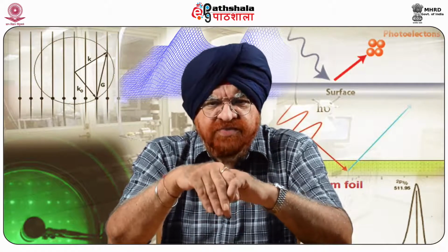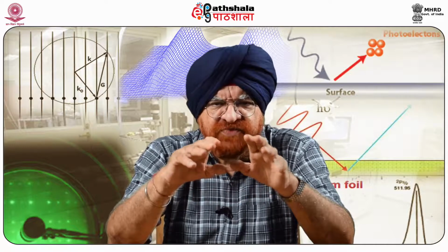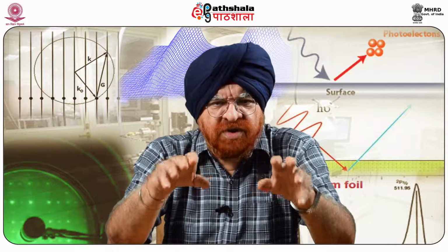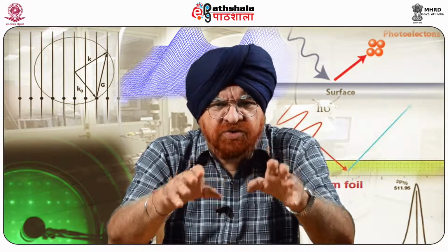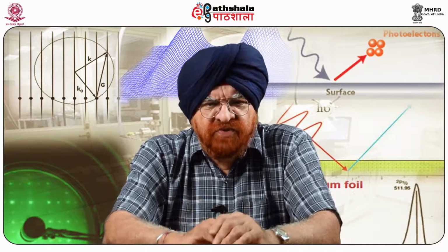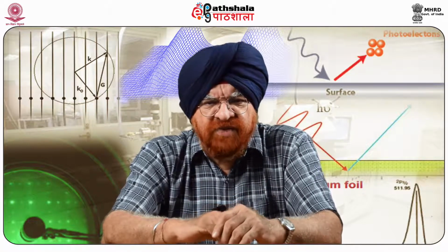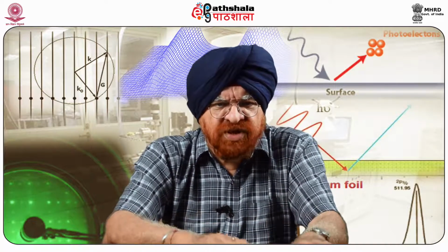Atomic force microscopy is a powerful tool for probing intermolecular interactions because it can resolve forces with piconewton sensitivity. That means at the piconewton level one can analyze this, and it has a spatial resolution in the nanometer range. These features enable AFM to produce nanometer to micron scale images of, for example, topography, adhesion patterns, friction, and compliance, and thus make AFM an excellent characterization technique for fields ranging from material science to biology.